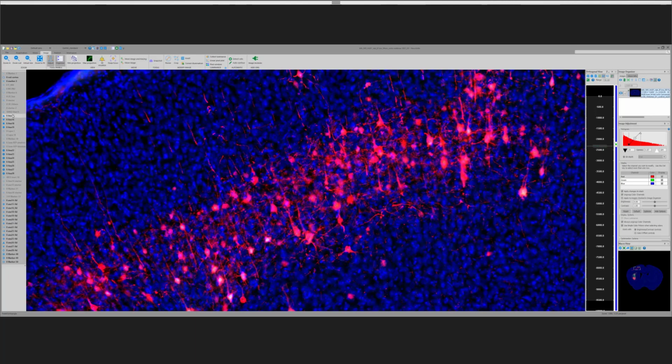These are the cells that we're interested in seeing and registering to the Allen space so that we can count the number of neurons in every area and compare between conditions. Let me just change the size so they might show up a little bit better. You can see those, okay? So this automatic cell detection method enables us to view the cells.